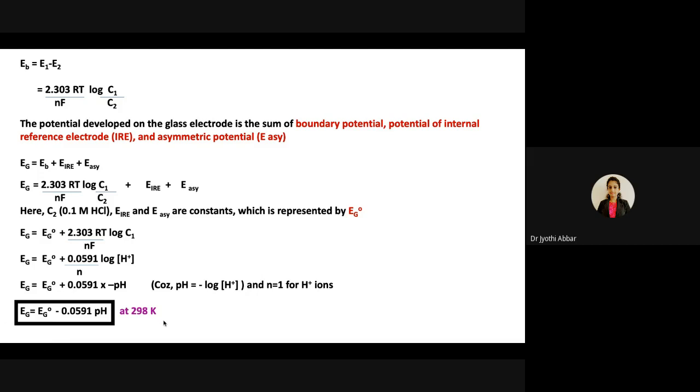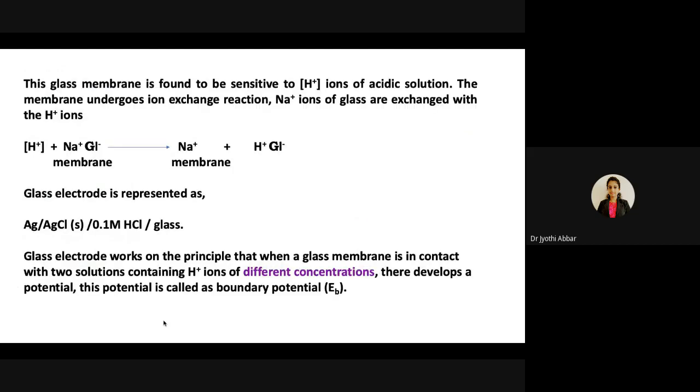So this is the overall explanation of the construction and working of the glass electrode. This is actually a very important question. In case the Nernst equation derivation is not asked, the chances of this being asked in your exams are very high.